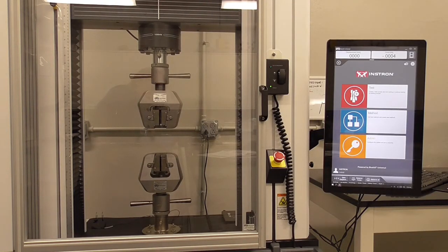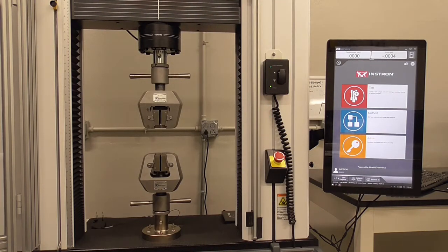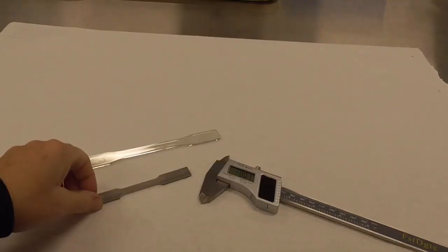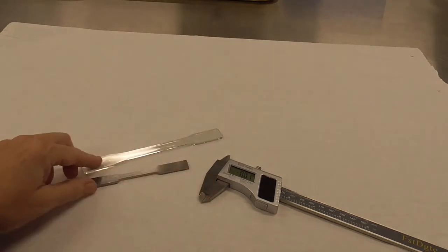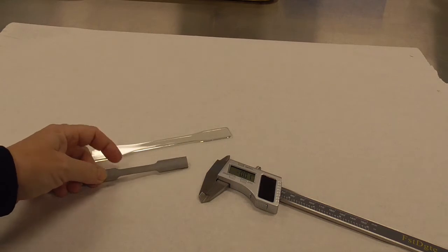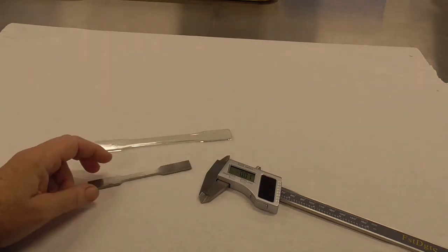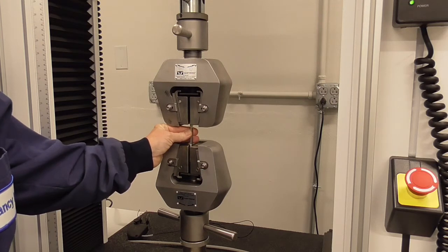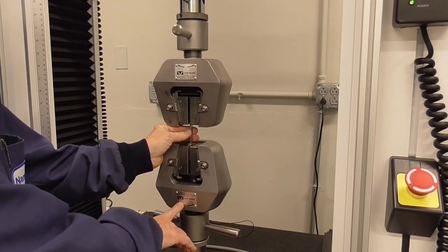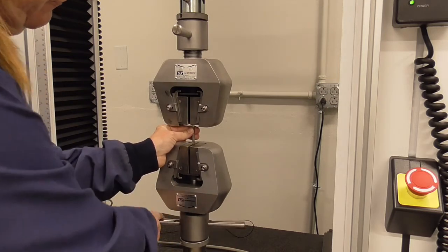We need to load our sample into the grips. If the machine is on, you can open the door. You will be testing various dog bone samples like this steel one. First label the samples and make the appropriate measurements — the gauge length, the width, and the thickness. The dog bone will be positioned between the grips and tightened down with these knobs. Position it in the middle of the grips and tighten.